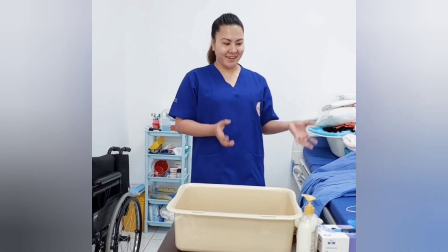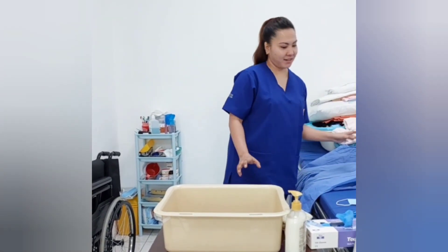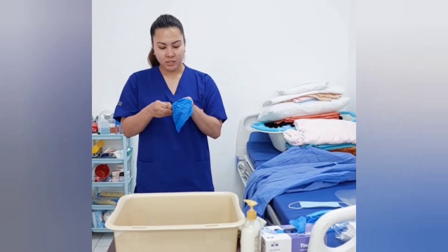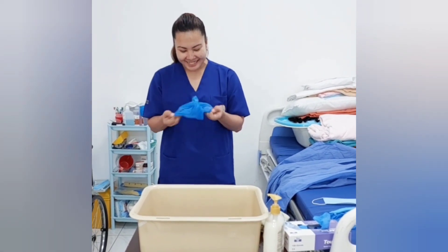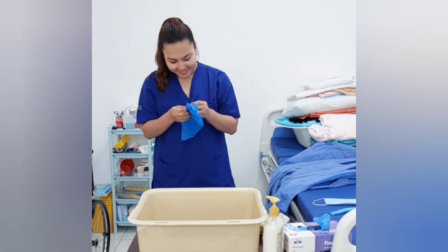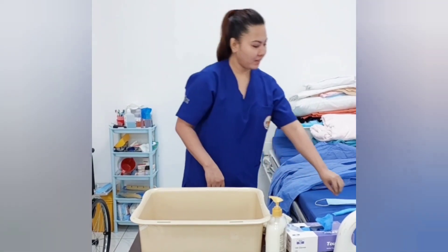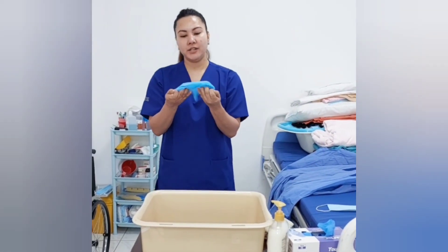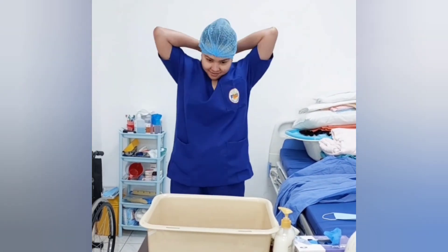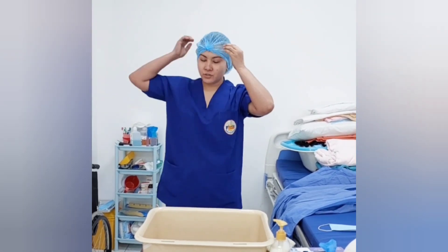How to don the PPE. I have everything here with me. First, I will put on the shoe cover. Next, I will put on the hair net. Make sure to cover all the hair inside so it will avoid contaminating.